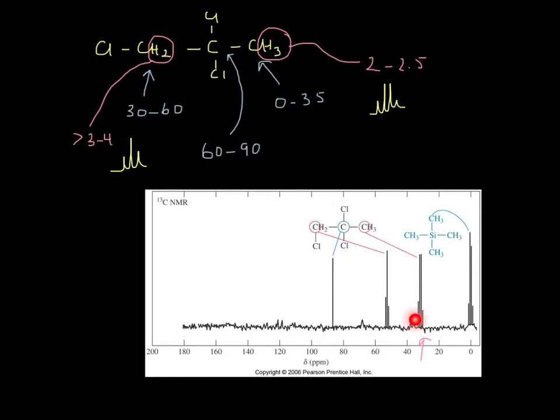It's basically where it will allow all the carbons to be split by their local hydrogens. It becomes very hard to read if you don't have a really good high-powered NMR, and also if you haven't run it for a sufficiently long period of time. Therefore, it's normally not done. Again, at a certain point the information is overkill. We can tell most of what we need to know from hydrogen NMR. The carbon NMR will usually seal the deal if we need it. Doing this off-resonance decoupling to see doublets and triplets and quartets in carbons is helpful on occasion, but usually you can figure this information out without it.